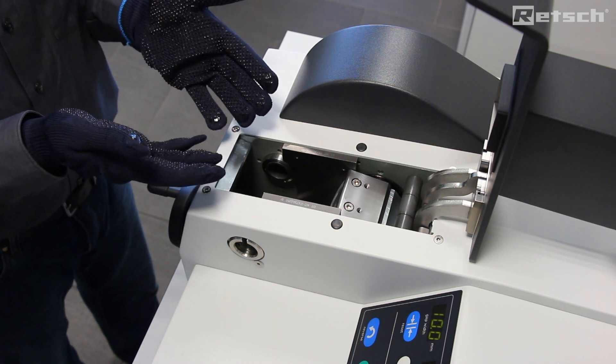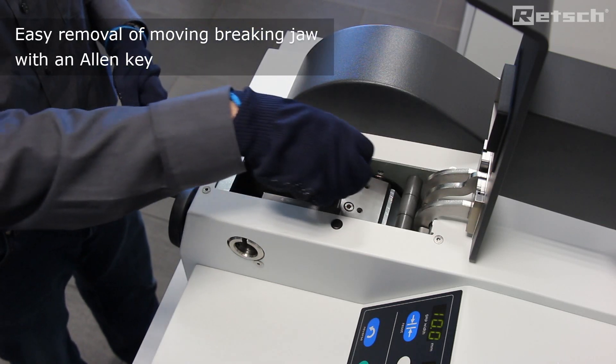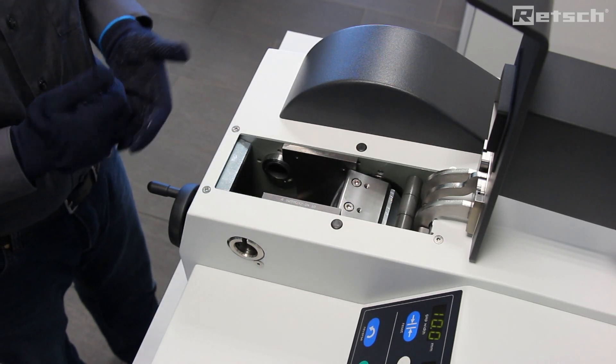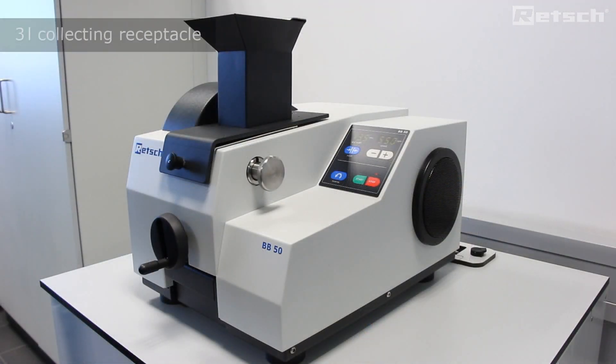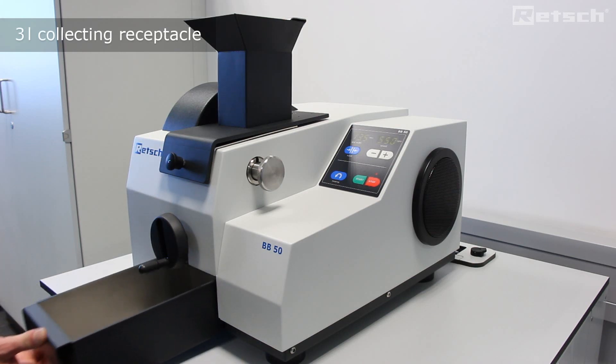If required, we can simply take an allen key, remove these two allen screws, and lift out the back breaking jaw for a deeper clean. The instrument also comes supplied with a 3 litre collecting receptacle to collect the crushed material.